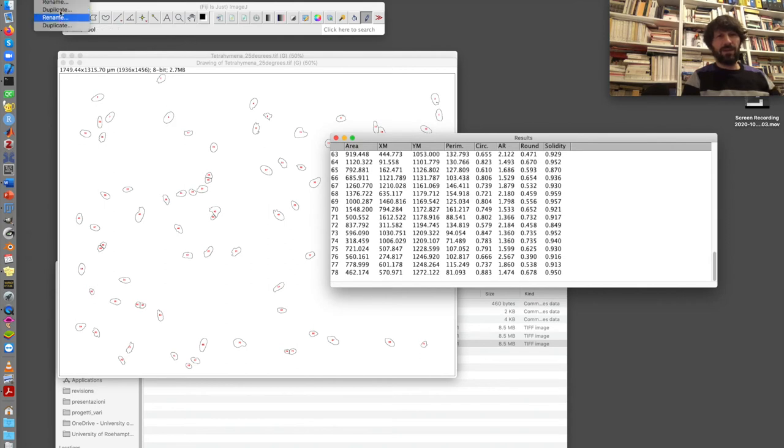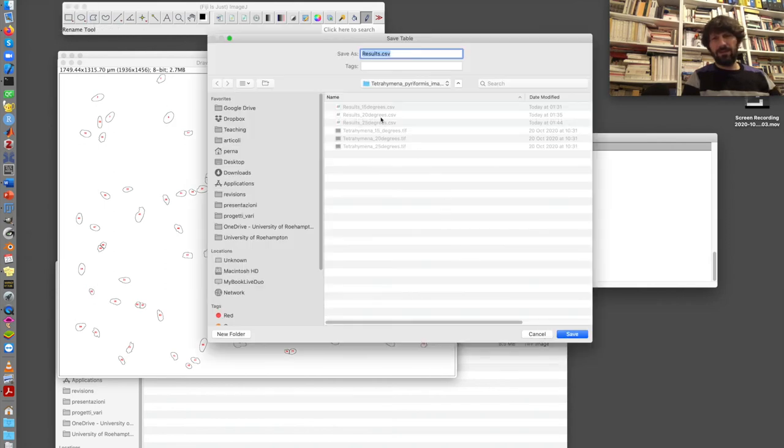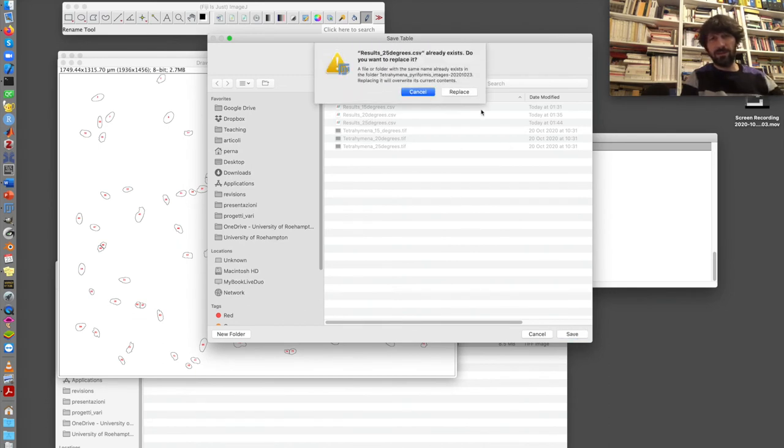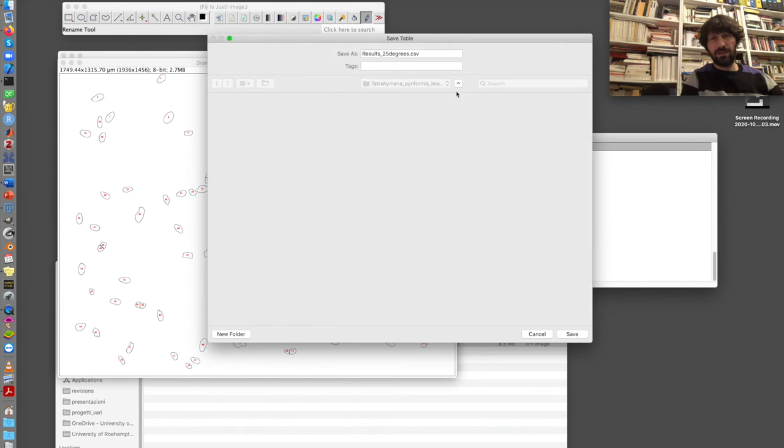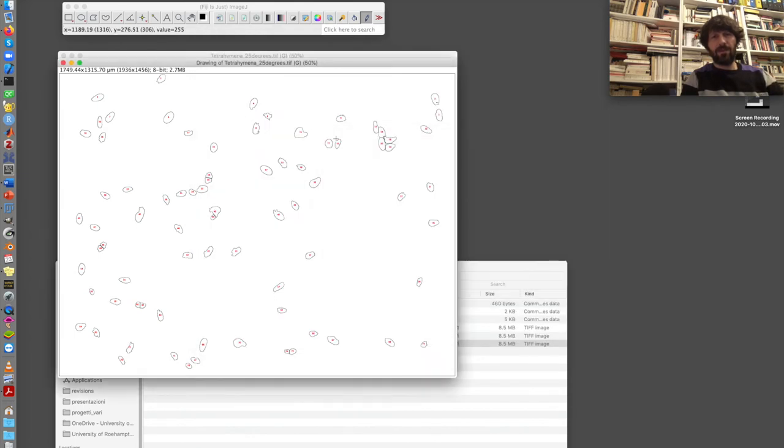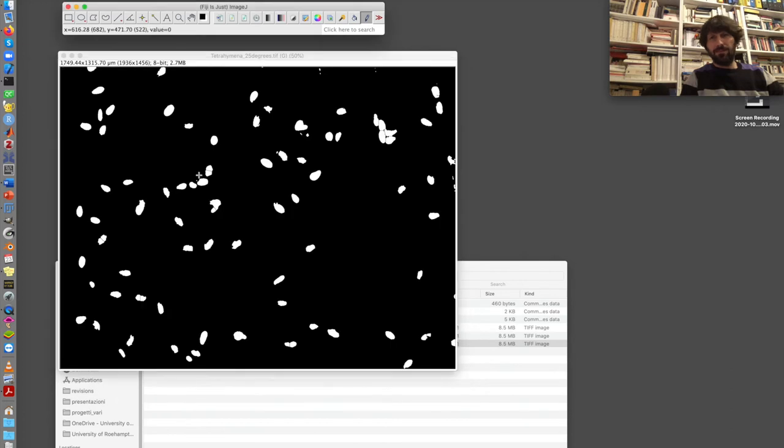File, save as, and we have the result 25 degrees. I had already one here, but let's take this one, which seems good. We have done this with this image analysis part.